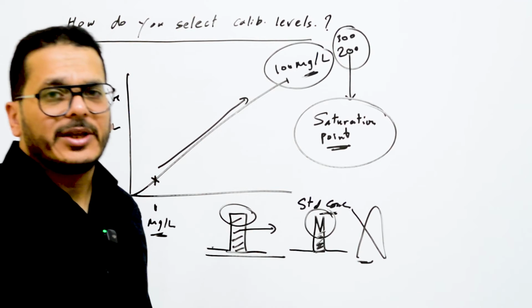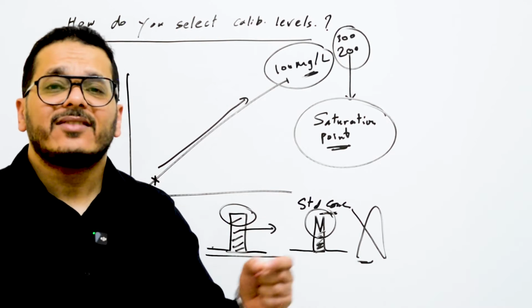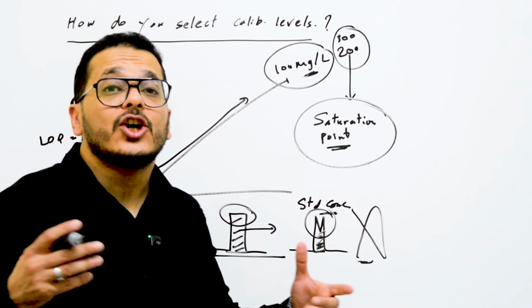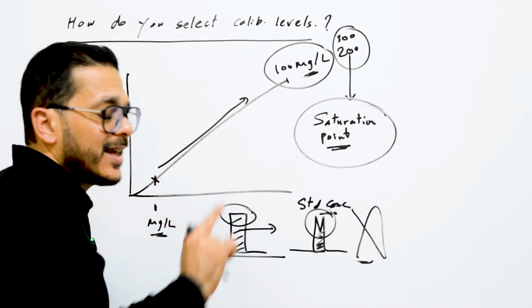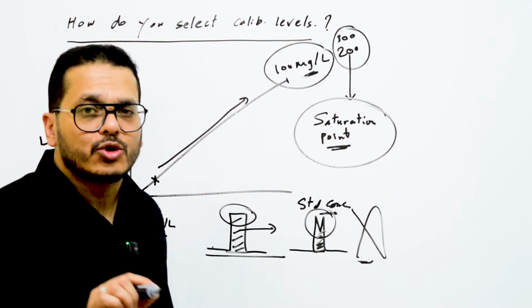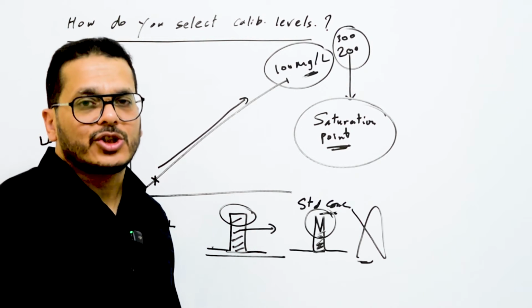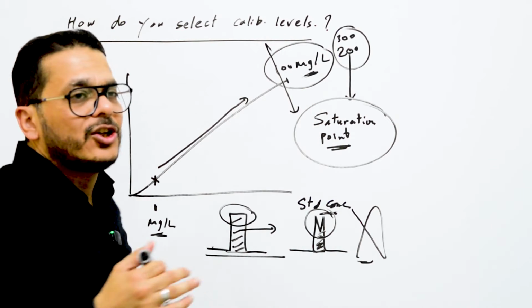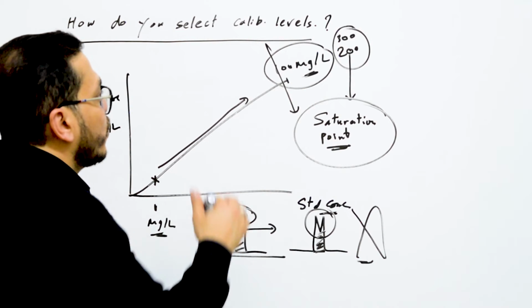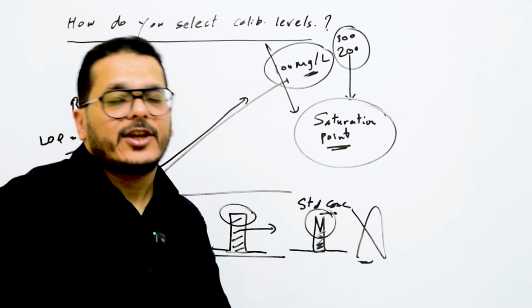When you receive a new instrument, as an example, the sensitivity of this instrument is very high. That means you can get the lowest concentration required with a very accurate result, but the higher concentrations you cannot get easily. So it is better not to go for very high concentrations in the case of new instruments.